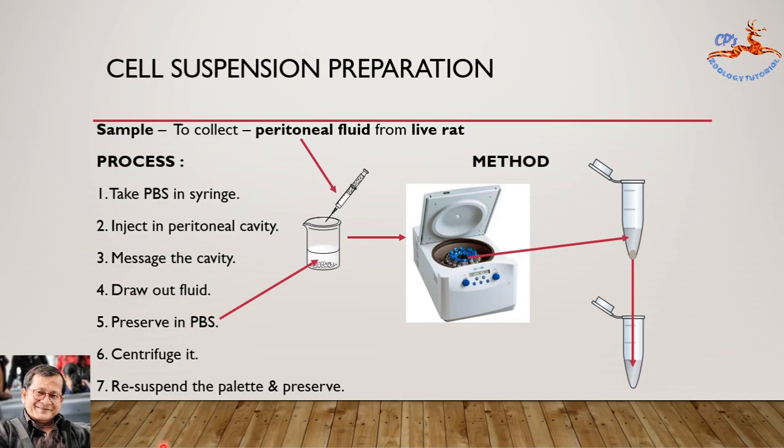Now let us centrifuge it. Take 1 ml of the cell suspension from this beaker — taken from the stock solution — and place it in a centrifuge tube. Centrifuge it inside the centrifuge machine at 1000 rpm for 5 minutes at room temperature. After 5 minutes, you will find a supernatant and a pellet. The supernatant liquid should be discarded, and the pellet will be resuspended again with PBS solution. This resuspended cell solution will be ready for the staining section.